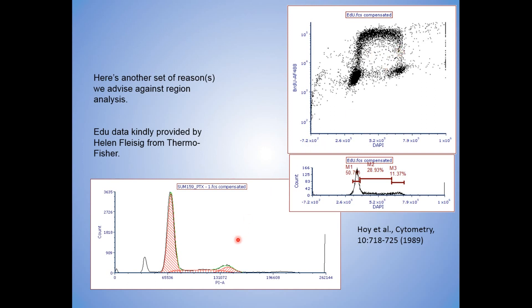Same thing for over here. That's the spill in over here. And you'll actually see a little bit of G1, G2, G2M, and a little bit of spill in from G1, G0. And that's fine. You've got these little guys over here.